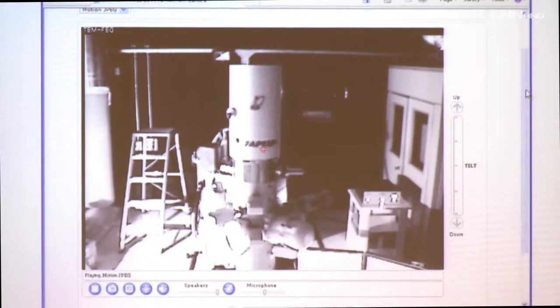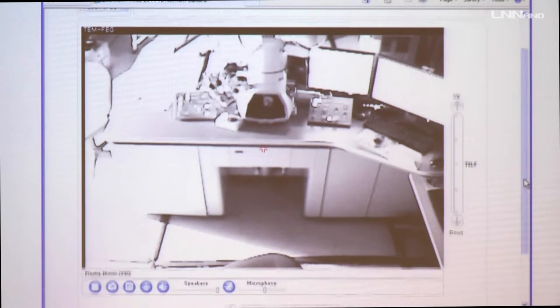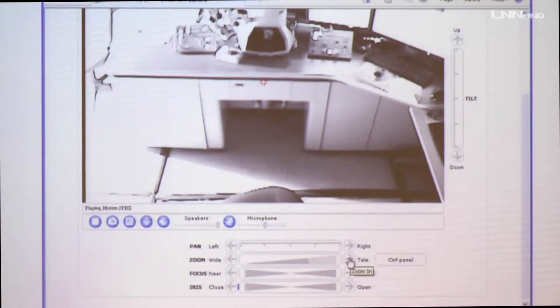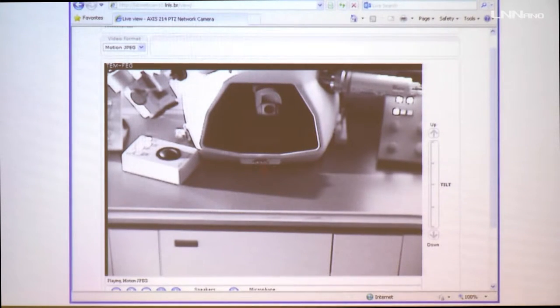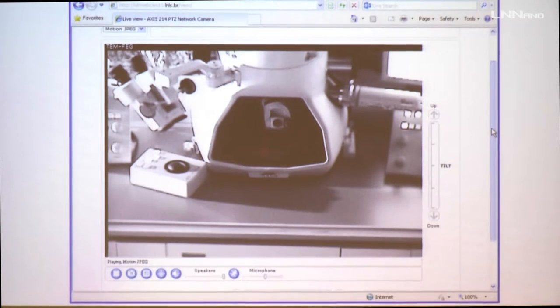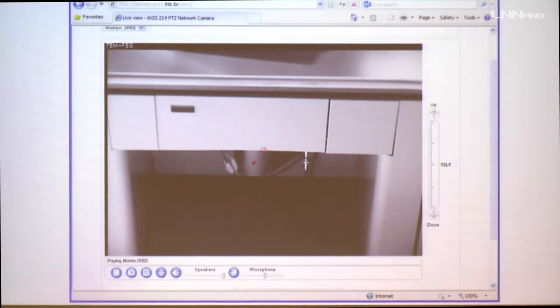And electron detectors, again, I need to show you here. Here we have one detector, that's a camera, the top camera. And here we have the fluorescent screen. Just above the fluorescent screen, we have a small screen for quickly seeing small particles on the screen itself. We can also use that screen for alignment. And a few more detectors, we have this one. This is a GIF camera.